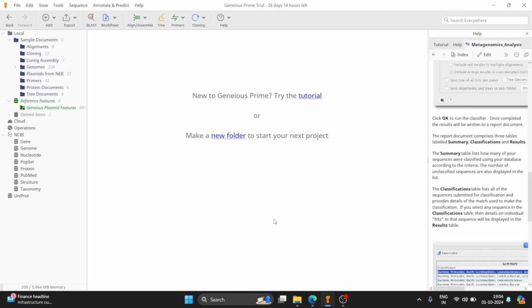So we will get the required Amplicon data first in this, and then we will be clustering the reads using the de novo assembler. Then we will do the blast of the assembled hits, and we will create a taxonomy database of it. And then finally, we will classify the Amplicon data with the sequence classifier.